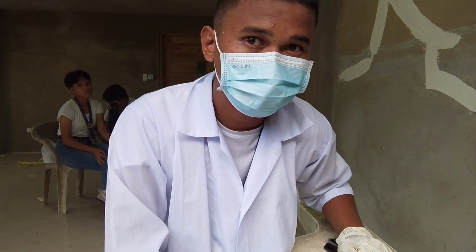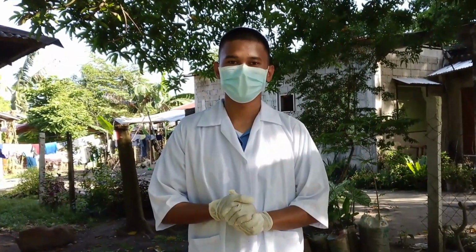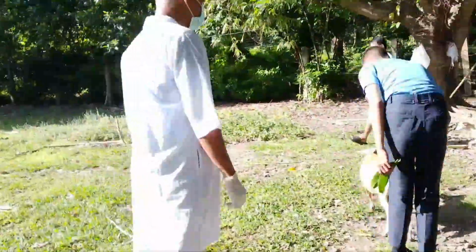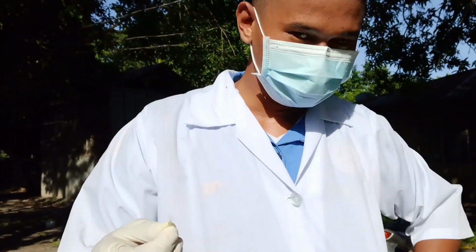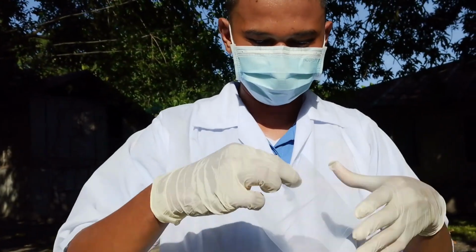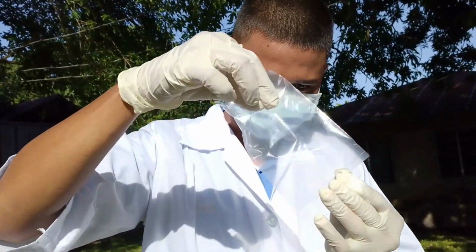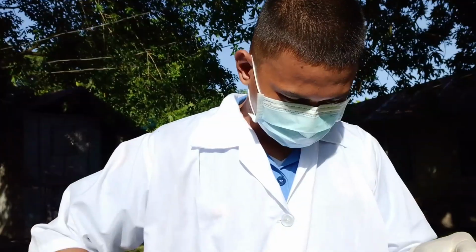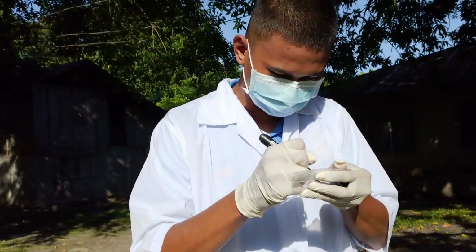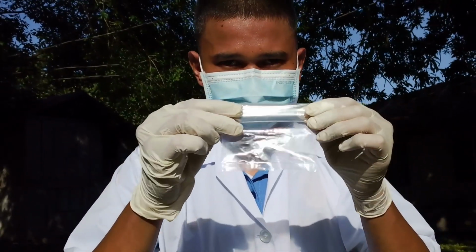I will now proceed to collecting the animal hair. The first animal hair I will collect is the hair of the goat. I have here the hair of the goat, so I will now put it in the plastic. After putting the goat hair in the plastic, I will label it. I am now done collecting the hair of the goat, so I will proceed to the second animal.